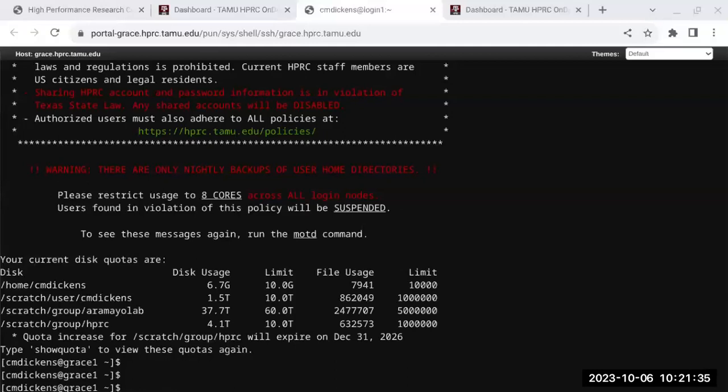If you do have a problem after trimming, if you have like 10,000 reads in one file and only 5,000 in the other, then they're not paired. They should have the same number of lines. If you have that problem, there are tools where you can pair the reads up again, so you'll have the same number and the corresponding IDs for each entry.